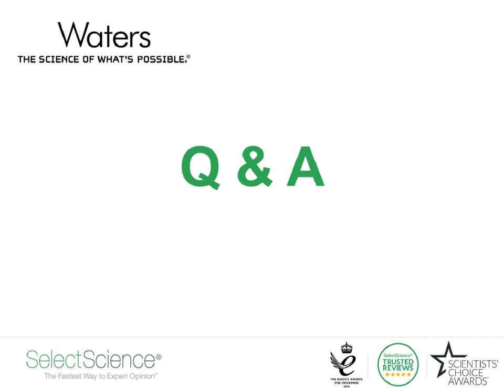All right. Our next question is, does ion mobility help quantitative measurements on peptides? And does using ion mobility spectrometry help or hurt dynamic range and sensitivity? Okay, I'll answer for the help.